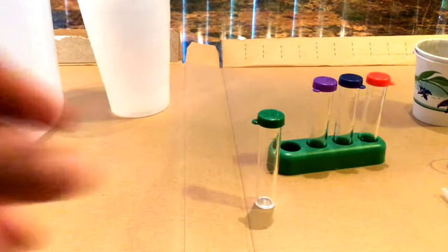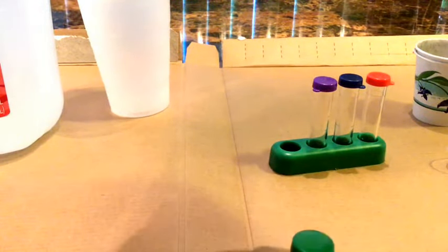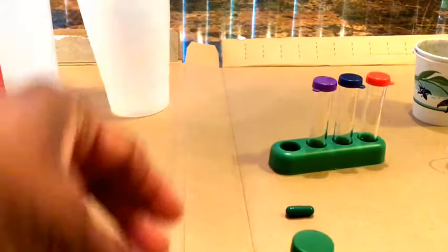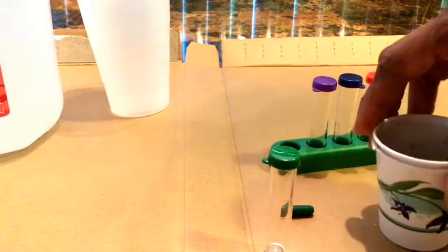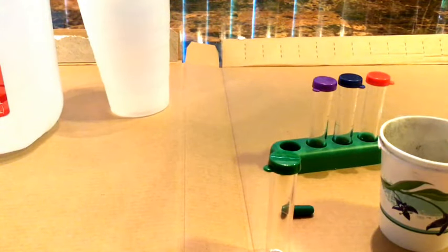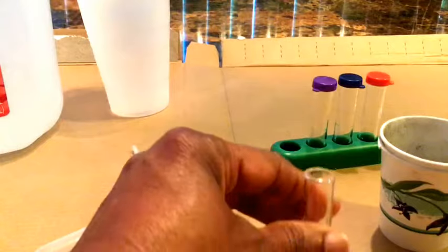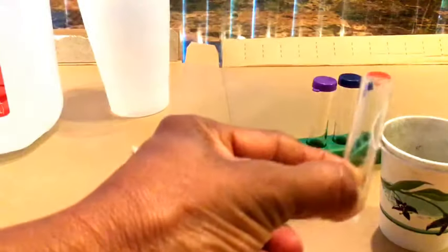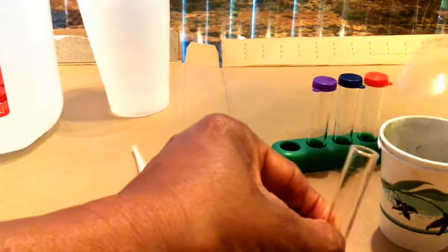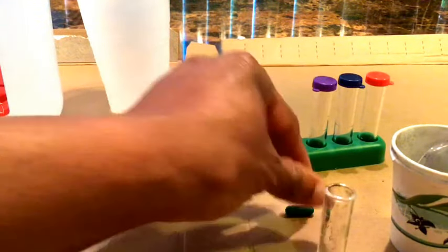The first test we're going to do is the pH test. I've got the tube, the capsules, the soil, and the little dropper. The first line is right there — I'm going to try to get our dirt in right there. Maybe I should have made myself a little sieve. Now emptying in the capsule.